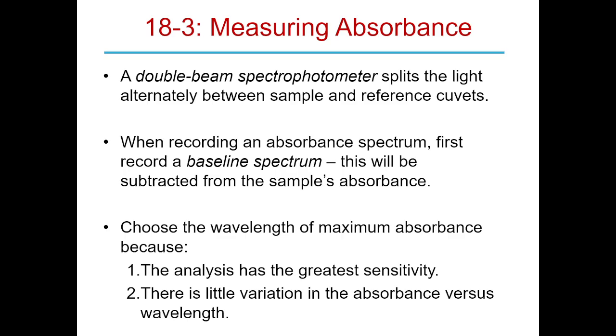Well, there's three things you always have to keep in mind and be aware of, right? Every time you do a spectra, there is your dynamic range, right? So that's the maximum concentration that you could do spectra with, okay? Then there's your limits of detection, right? And finally, there's how that scales.